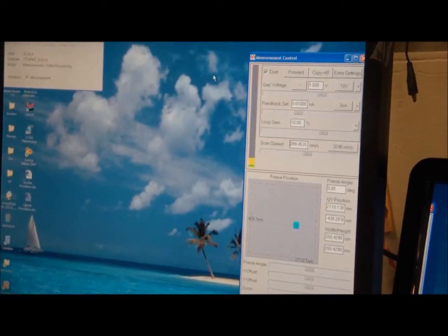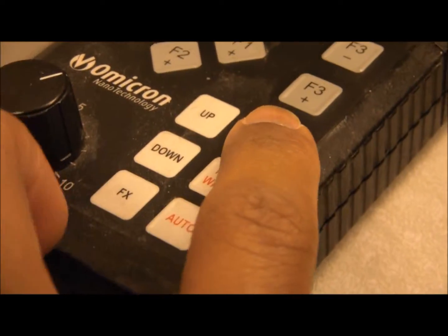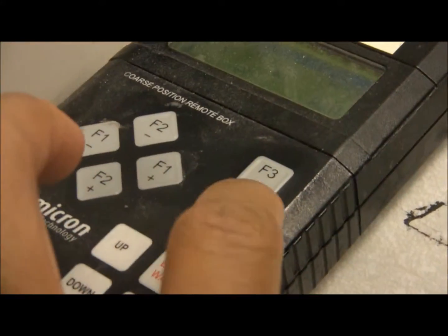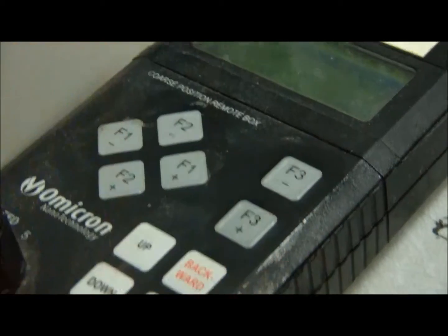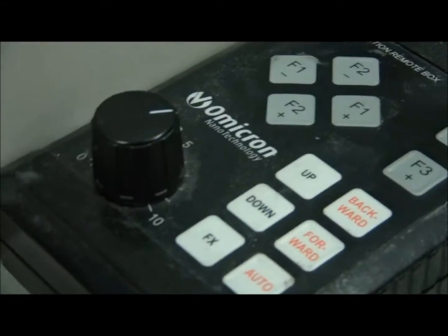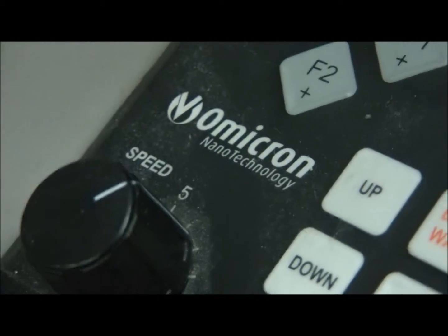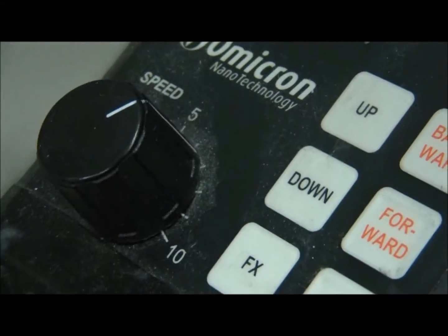Now, what I do is I assume manual control of it using this controller right here. I press backward — that allows you to have manual control of it — and then I press the forward button, which approaches the sample by three steps. It's important to have this knob, the speed knob, set to five or lower, kind of in the range of five.